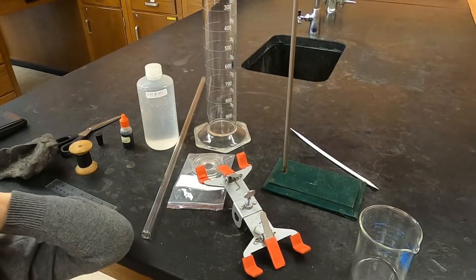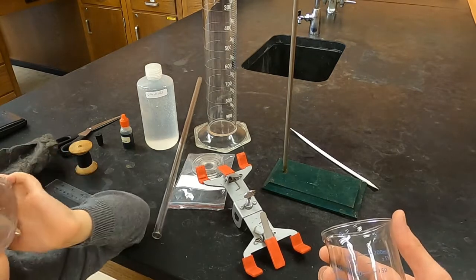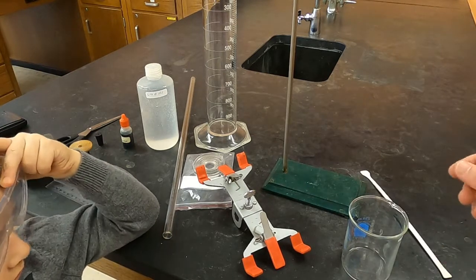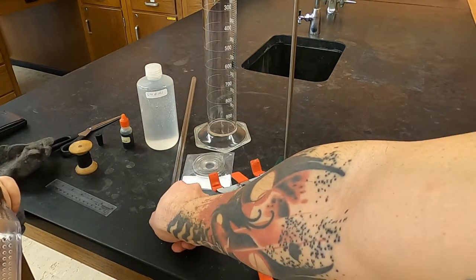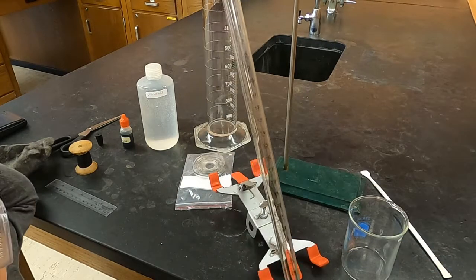These are the materials you're going to use for this experiment. From your drawer you're going to use a 250 milliliter beaker and a stir rod. Other things you'll need to get equipment-wise will be a burette clamp, a ring stand, and a 50 milliliter eudiometer or gas collecting tube.